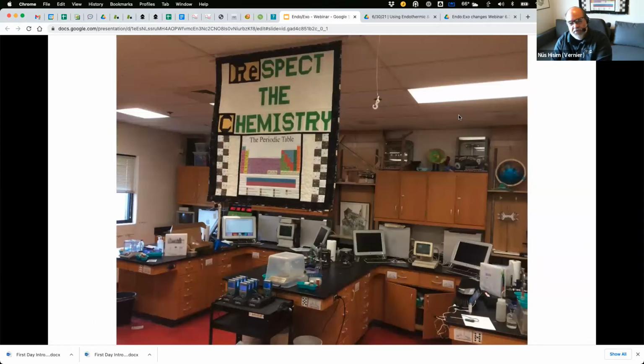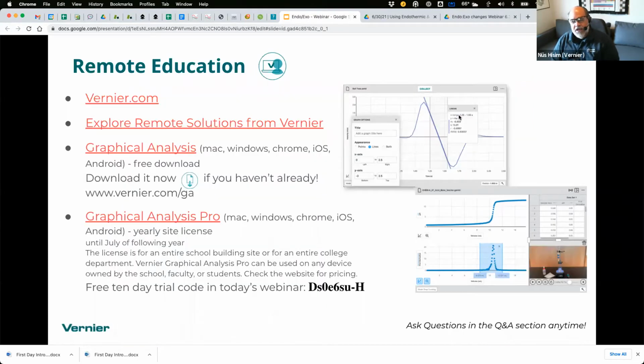A couple of things to be aware of. We have some stuff on our website, very handy, and you guys will have this slide deck, so you can go ahead and look through the stuff on here. We have some remote solutions up there. We're going to talk more about Graphical Analysis Pro here in just a second, and we'll see how all this stuff works.